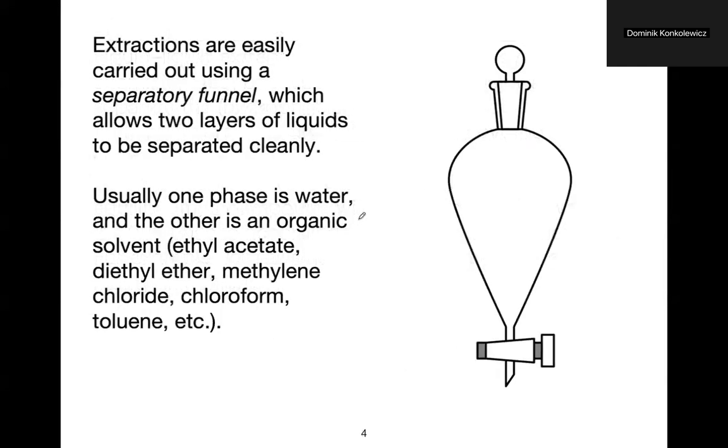Okay, so the technique and the equipment used to do a liquid-liquid extraction, okay? So the main equipment used is what's called a separatory funnel, okay? So we have here a stopcock, okay? So this is a stopcock here. And then we have a stopper up here, okay?